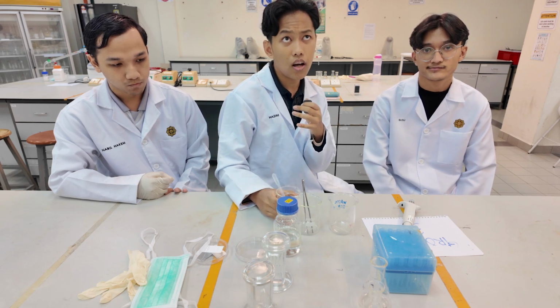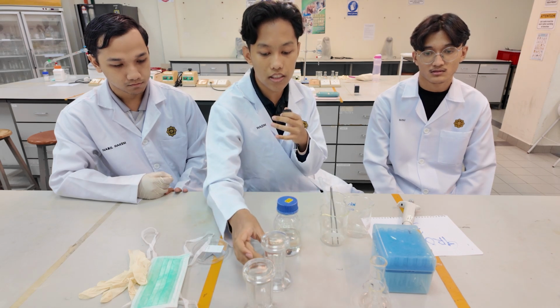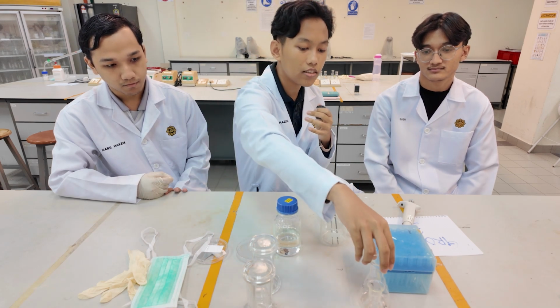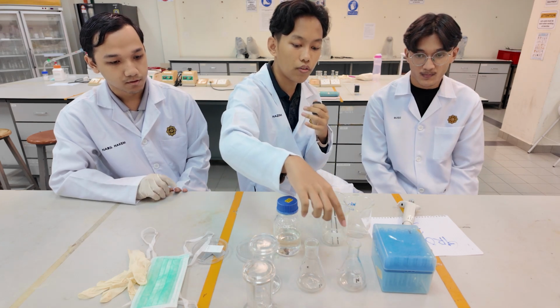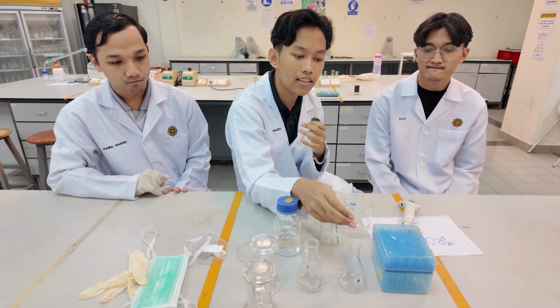Next, we need to prepare the solution that we are going to put into the developing chamber. We are using these flasks, and we mix a solution in each of them. First flask, we have hexane and DCM, hexane and ethanol.